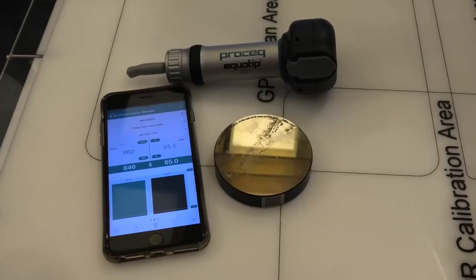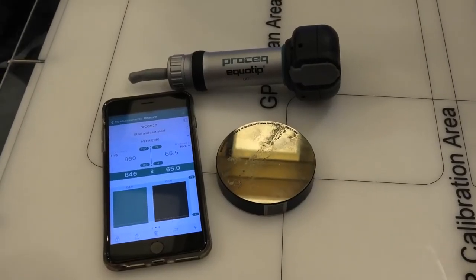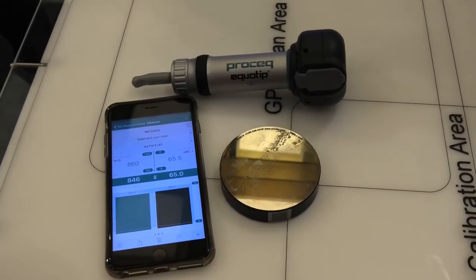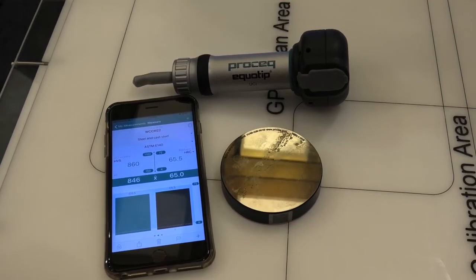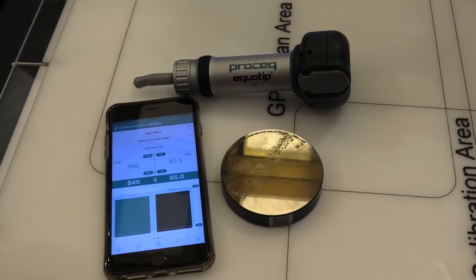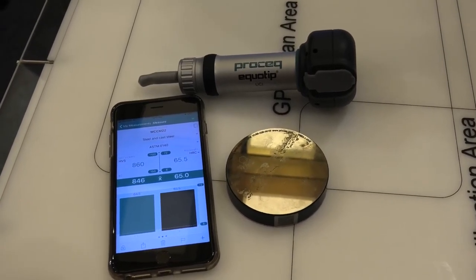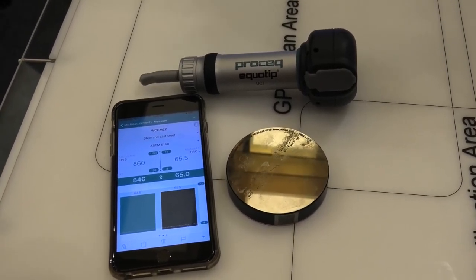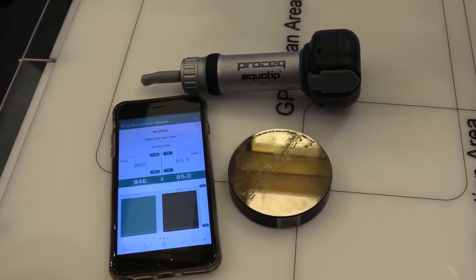Proceq Equotip Live UCI is a very easy to use instrument, which enables you to do quick reporting on site.